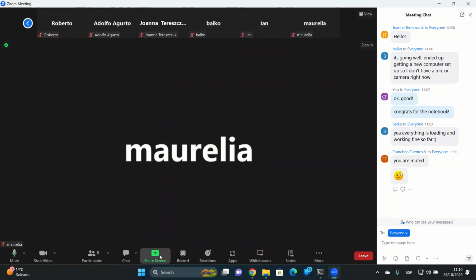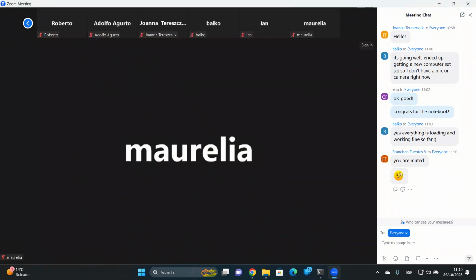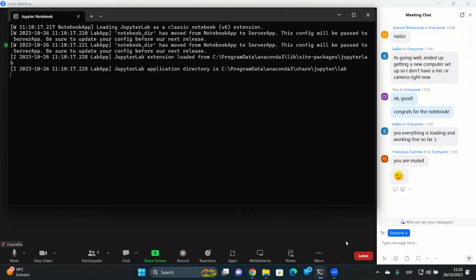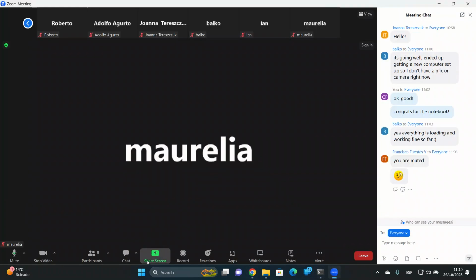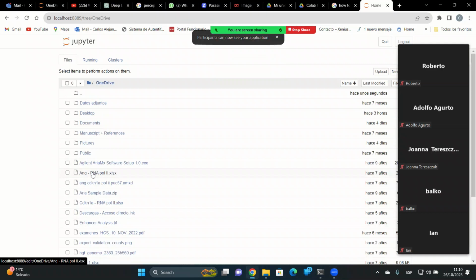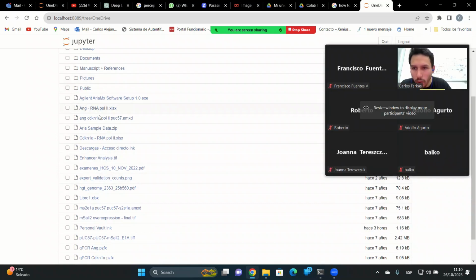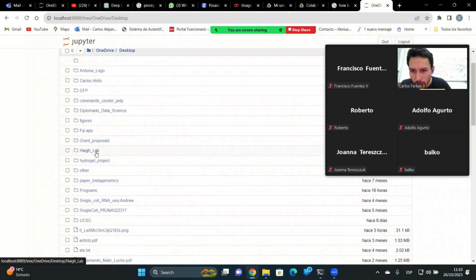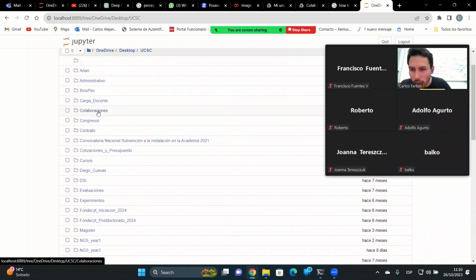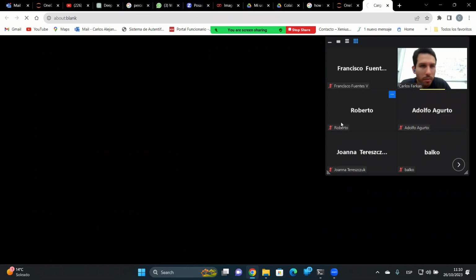So what I usually do, just to refresh what happened the last time, I say Jupyter. When you call Jupyter Notebook, you will see something like this. Okay. So in my case, I have everything linked to OneDrive here. In this case, I will open Desktop, go to UCC, and then go to my folder here. I will surf into my folder, just as I did last time. I have my notebook here.